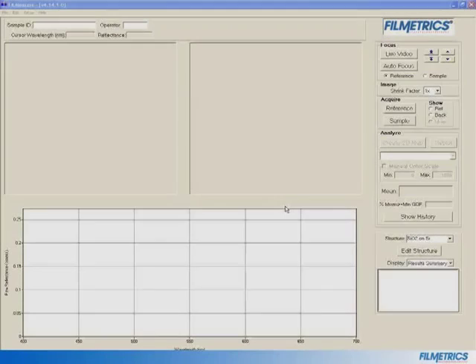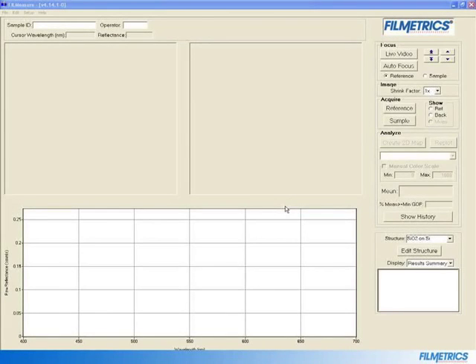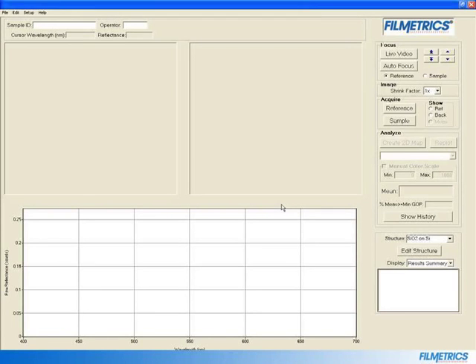Once you've started the software by double clicking on the Filmetrics icon, the main program window will display. To begin making measurements, start by going to Setup General Settings.